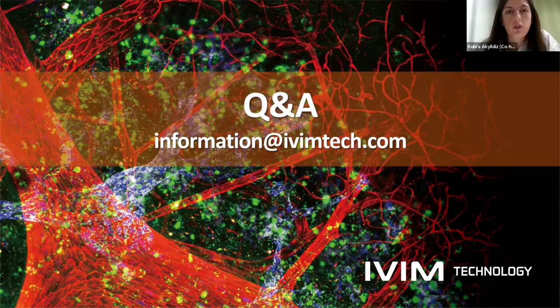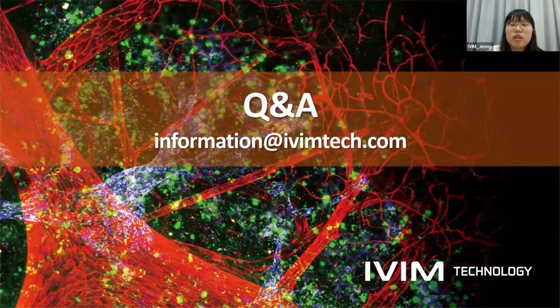Okay, he also has a following question. For the labeling, is it possible to tag other molecules with a fluorophore using IVIM's protocol, not just the antibodies? Yes, we can definitely conjugate other molecules with our protocol. We've currently done some with proteins. And if you would like to inquire to see if your sample is able to be conjugated with fluorophores using our protocol, again, you can contact us through email or you can drop us a Q&A on our website.